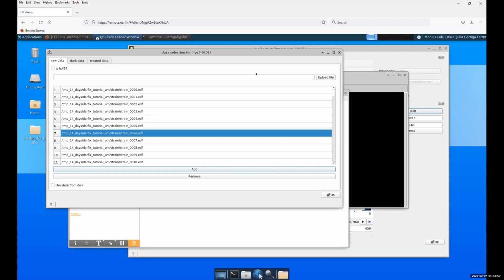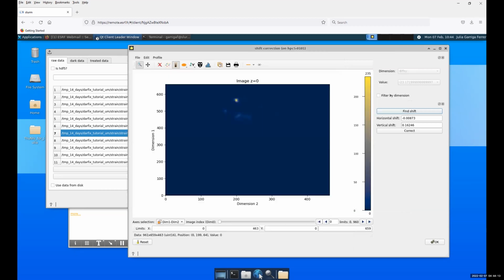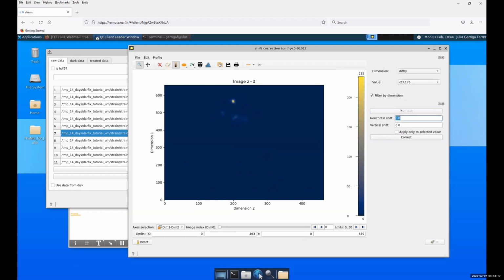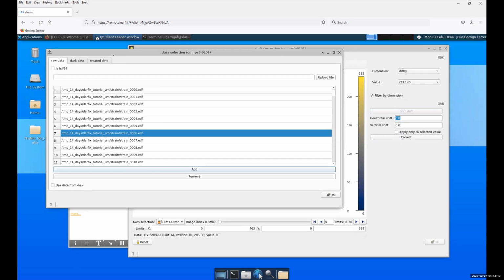Okay, but it was now at this data too, and there should have been a shift, shouldn't it? Right now I got result 2 when I filtered the dimension with this data set you have here. I downloaded it, so I have the reduced one. Of course, it's different, but the result was 0. And when I turned the toggle off and just normally found the shift, it found a slightly different value than yours. Okay. The data set you downloaded is the one that we sent you.